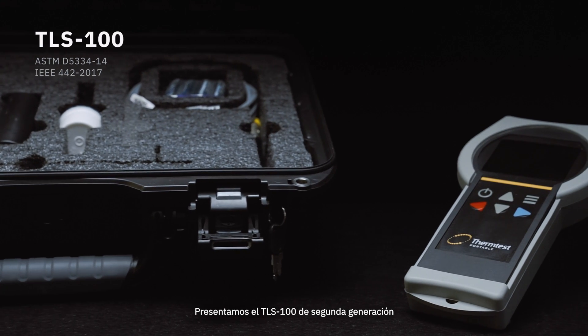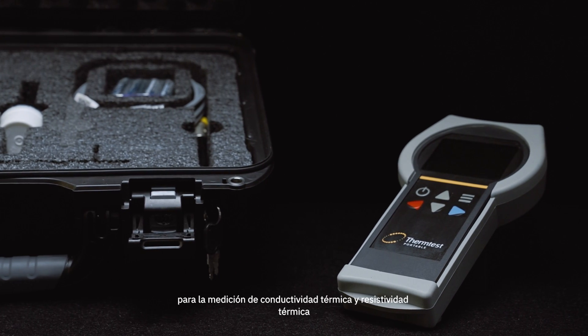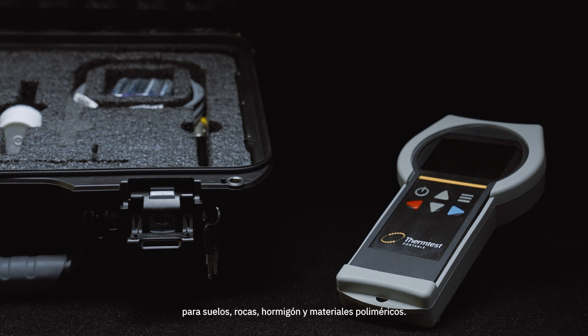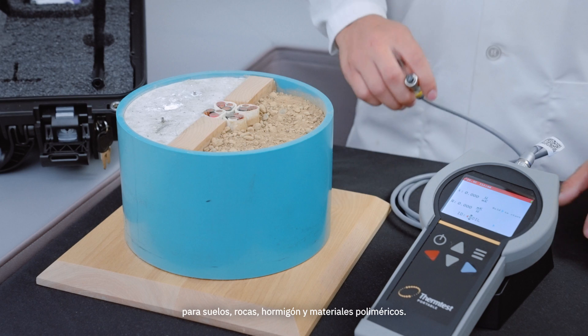Introducing the second generation TLS100 for the measurement of thermal conductivity and thermal resistivity for soil, rock, concrete, and polymer materials.